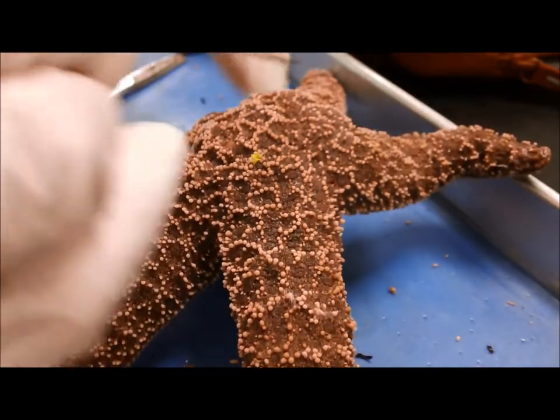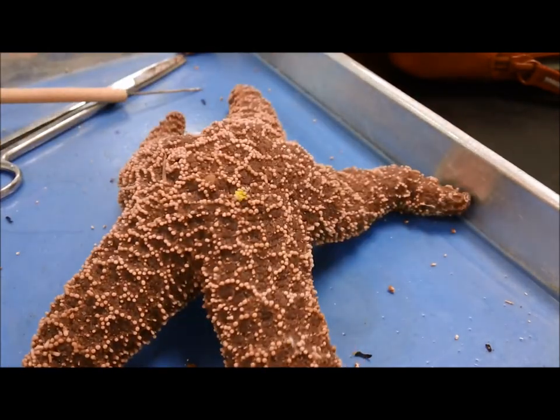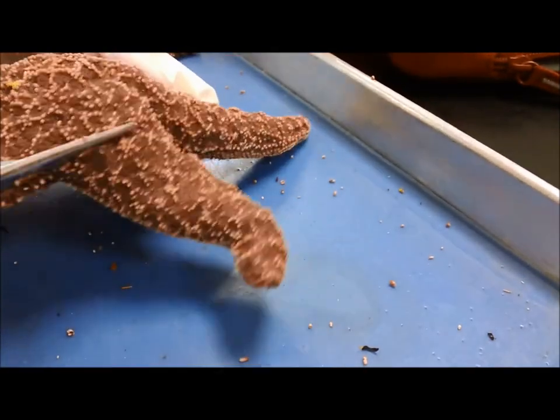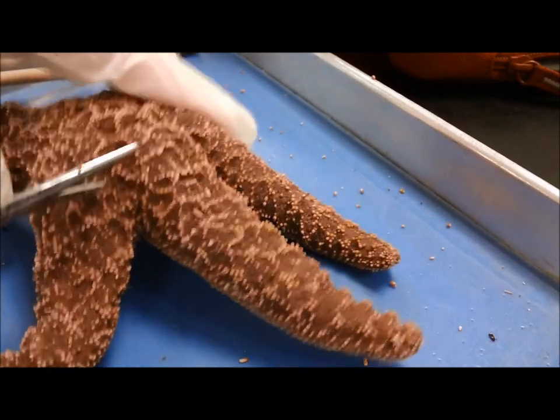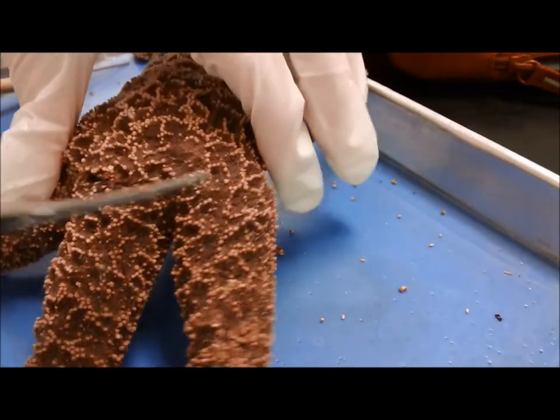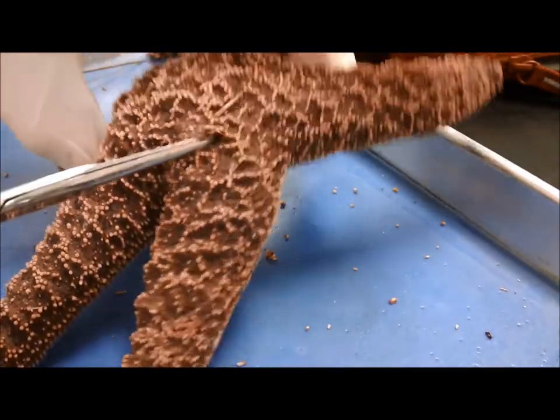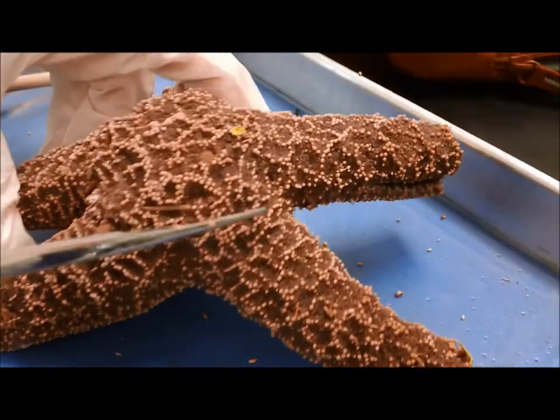This radial canal is going to attach to a ring canal up here in the center. Now the stomach is going to be up here in the center, and I can cut up into the central disk. Cutting into the central disk is usually a little bit easier than cutting the arms. Once I cut through the central disk, we should be able to see the stomach in all its starfish glory.